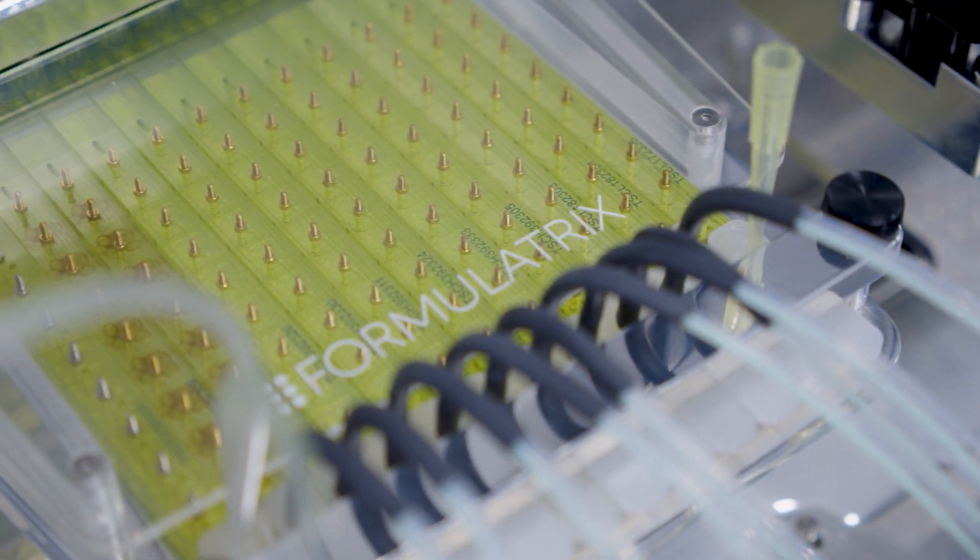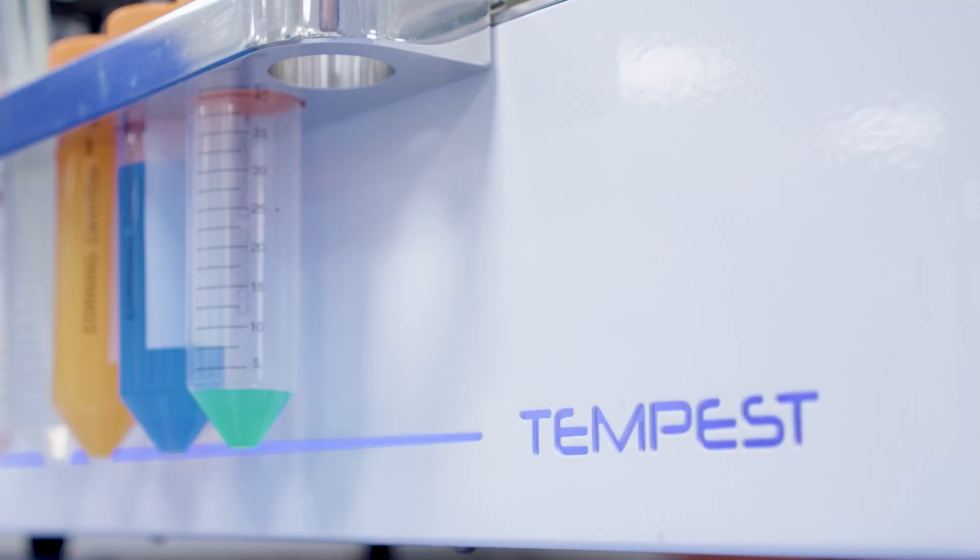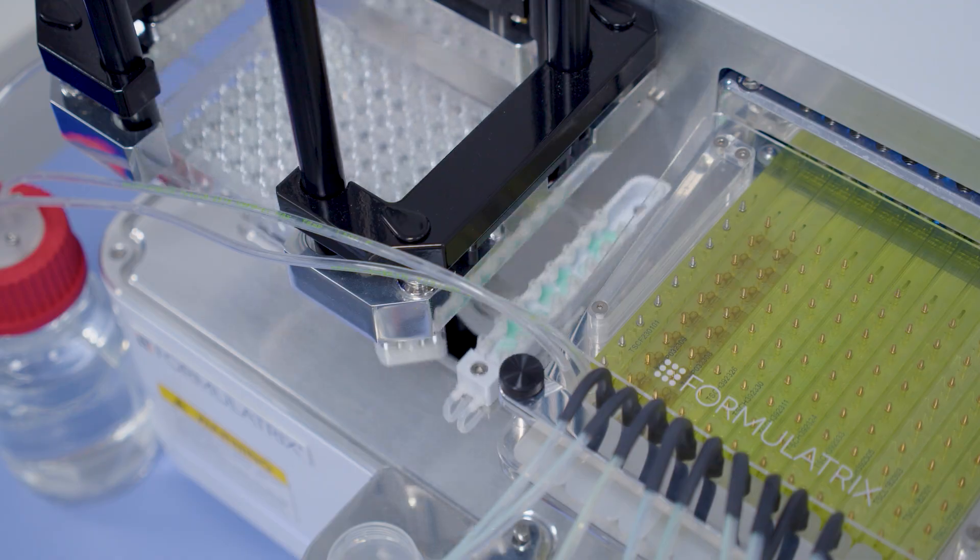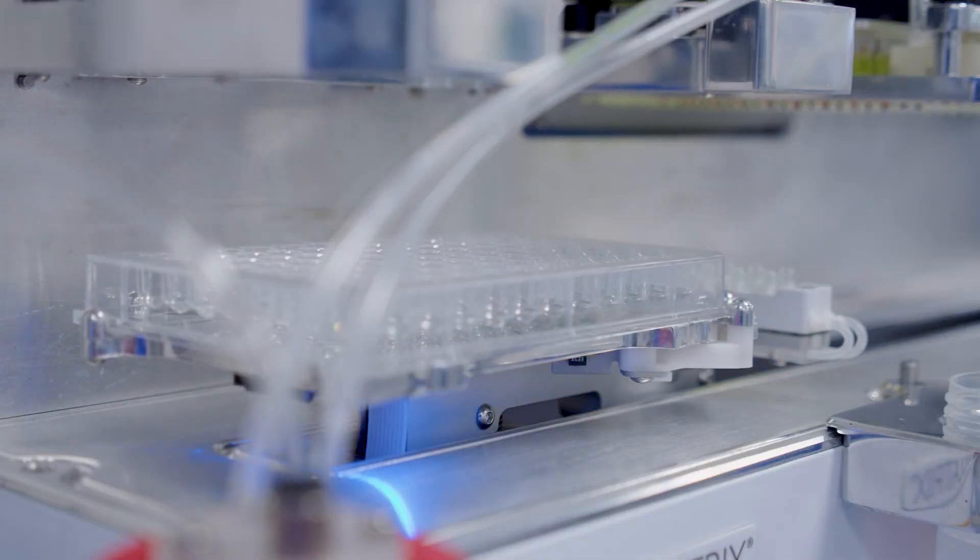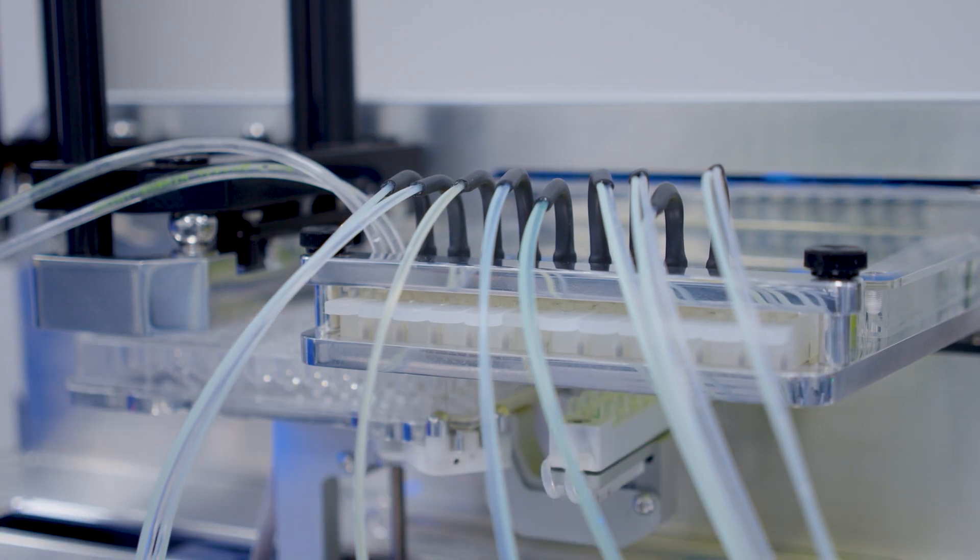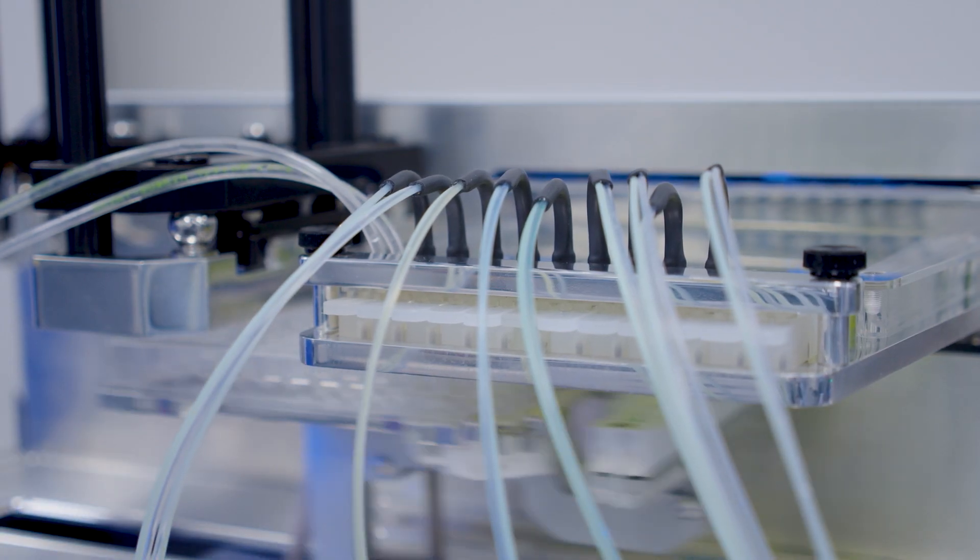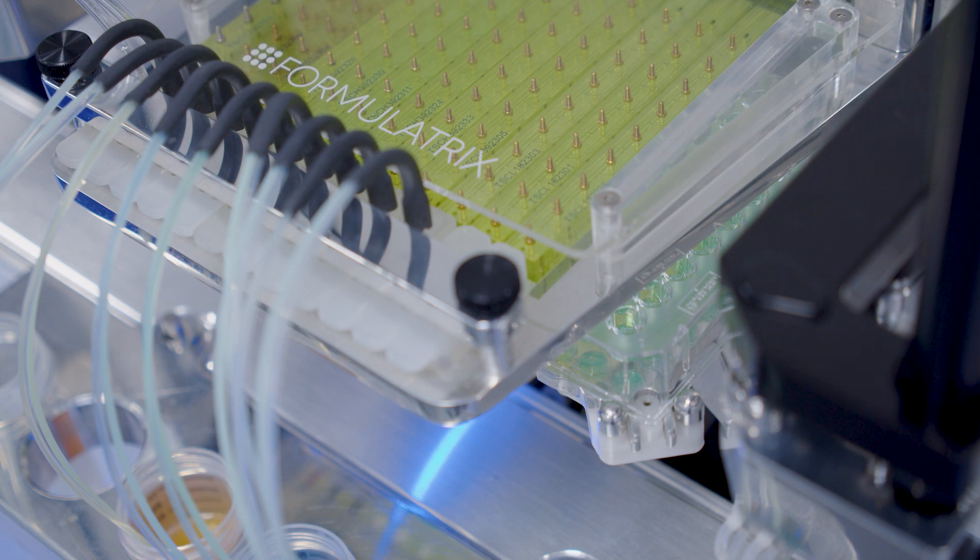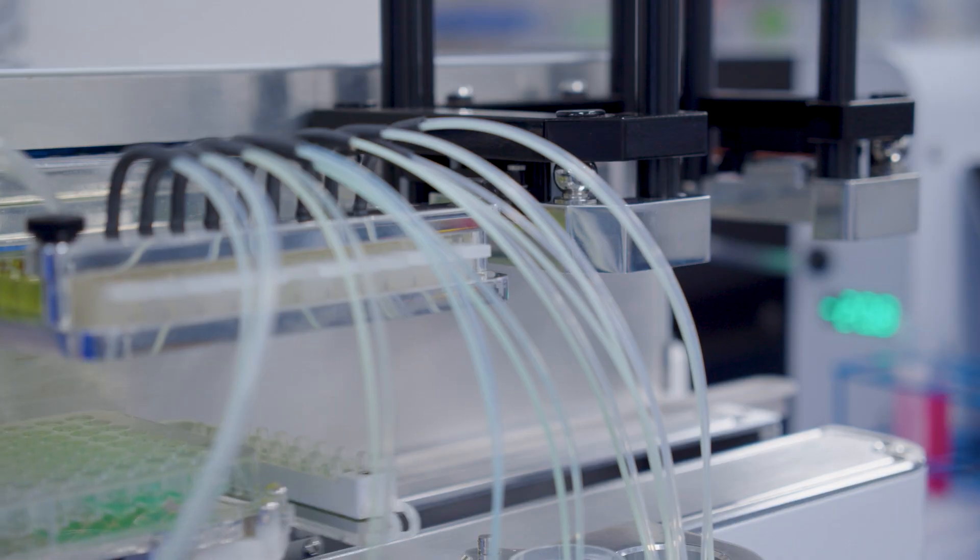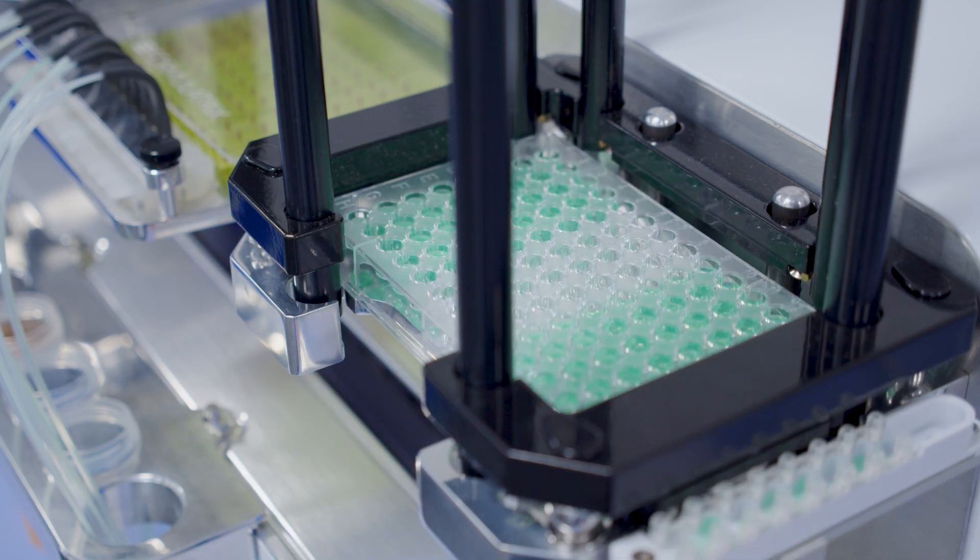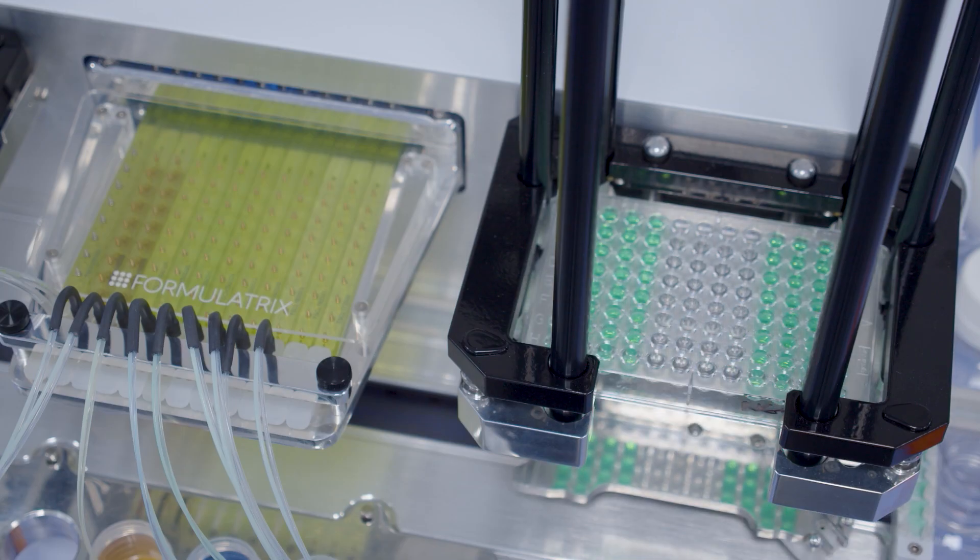The Formulatrix Tempest is a flexible and precise liquid dispenser commonly used for assay development using design of experiments protocols. The Tempest uses microfluidic chips that dispense discrete volumes of liquid with high precision.